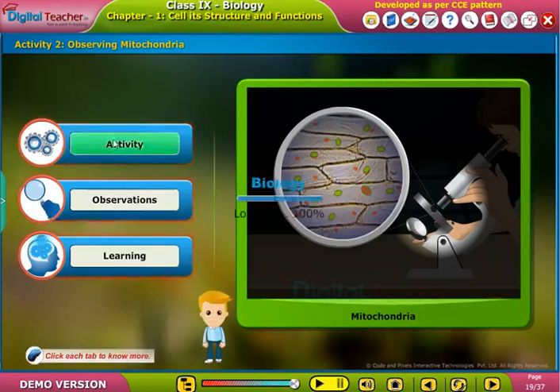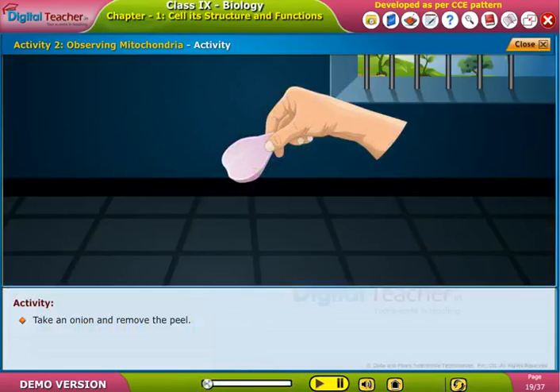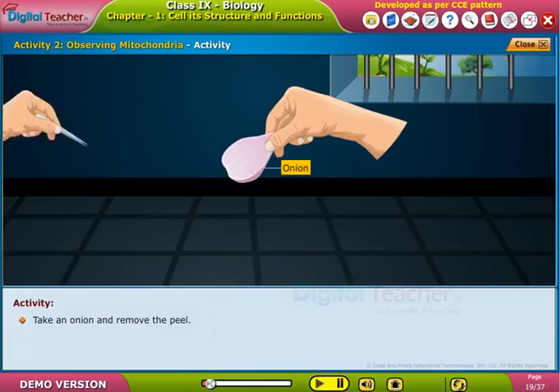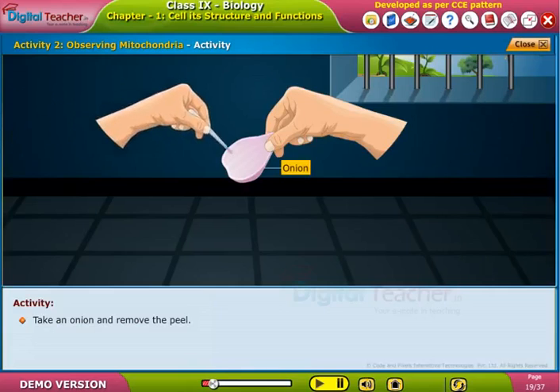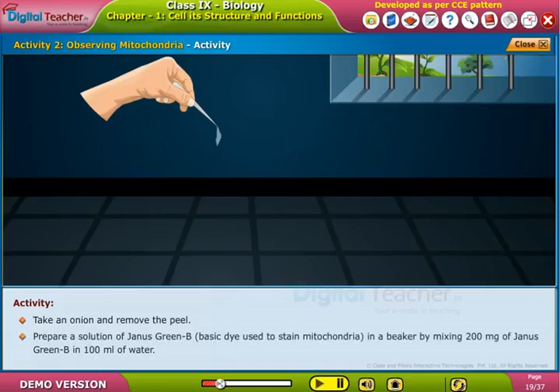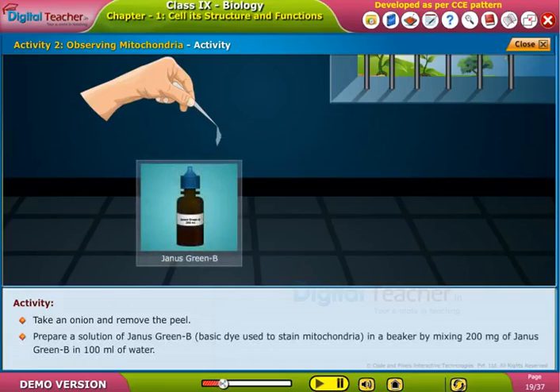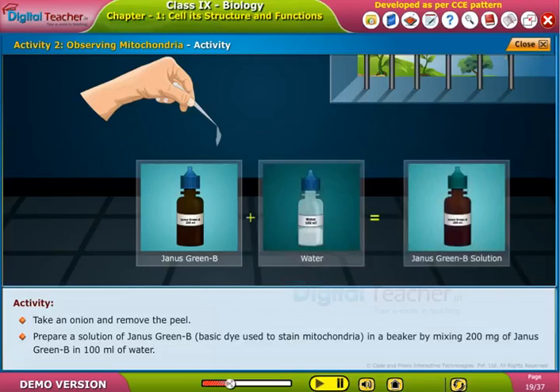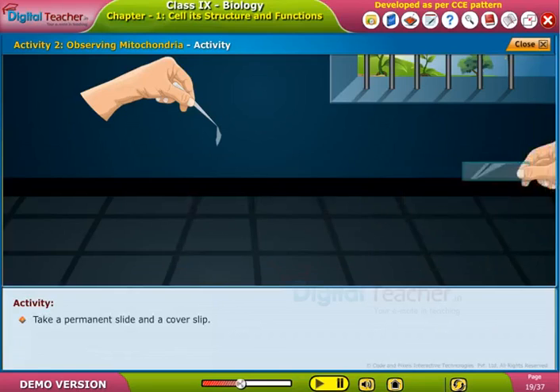Take an onion and remove the peel. Prepare a solution of Janus Green B — a basic dye used to stain mitochondria — in a beaker by mixing 200 milligrams of Janus Green B in 100 ml of water.